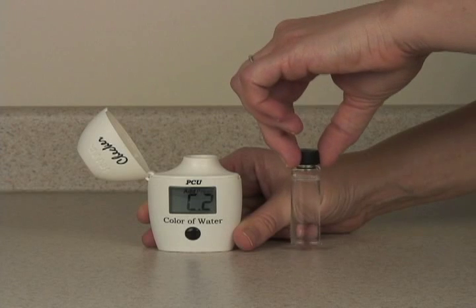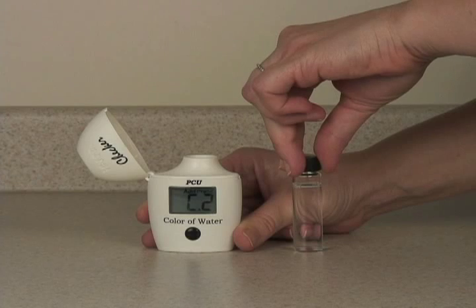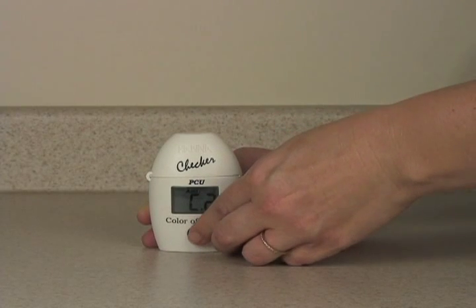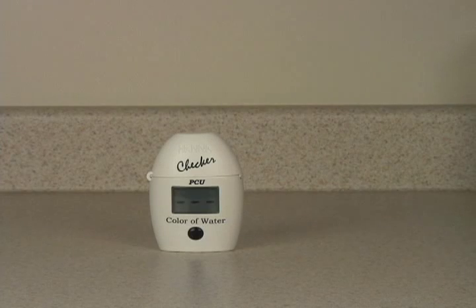Now you want to test the true color. Take your same sample water and run it through a 0.45 micron membrane filter. Put this filtered sample water in the cuvette, in the meter, and press the button once to measure the true color.